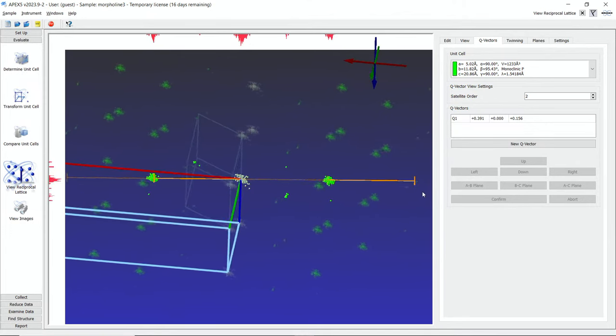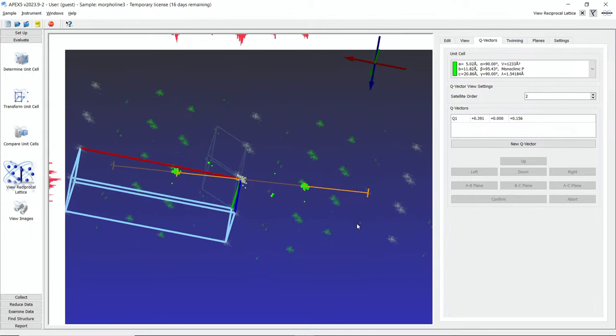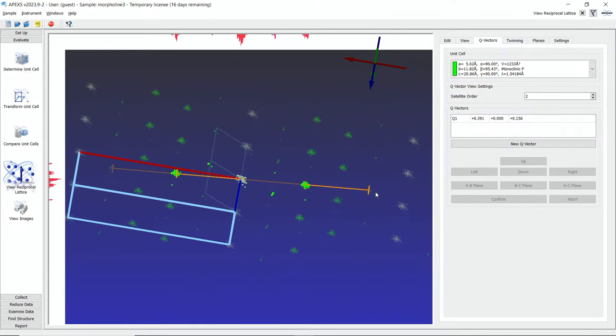It's really faint. I'm not sure whether you can see that even. But there is some faint repetition of these reflections. Yeah, I do see those. You see this? Yeah, you have to look, these really are really close. Second order satellites. Yep. Okay? Wow. So now we have determined this.